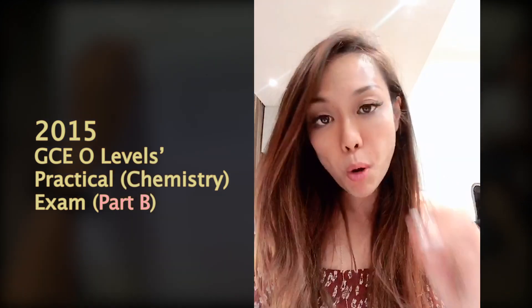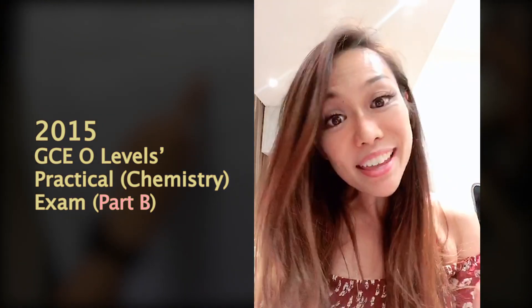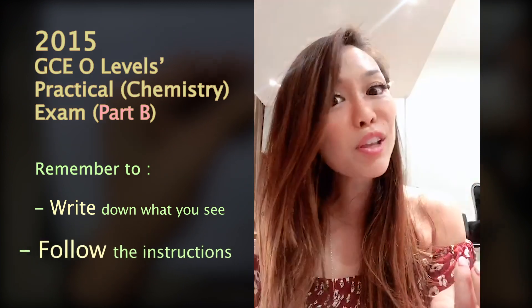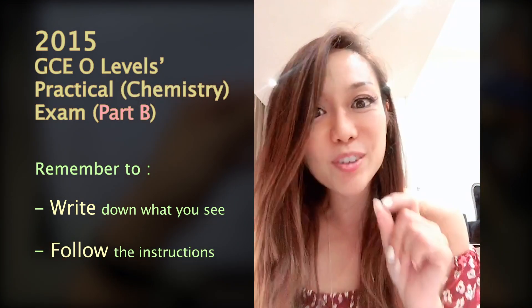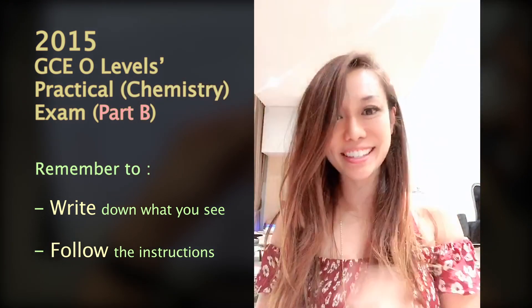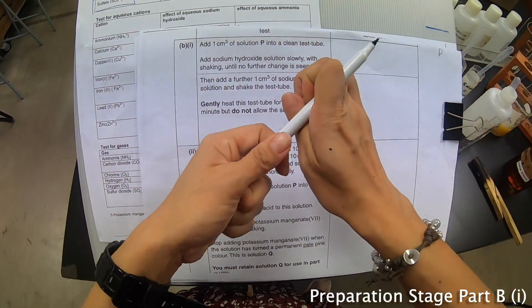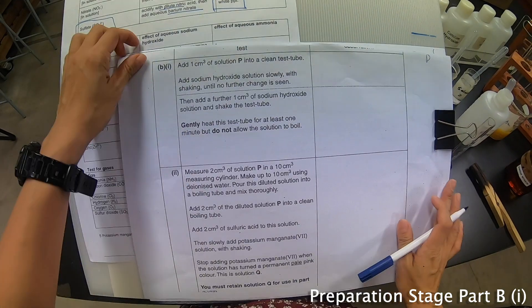We are now coming to the second part of 2015. This portion here is a fresh new sample. The same thing applies — if it's a fresh new sample, always remember to write down what you see and then follow the instructions. This time round you're going to see something interesting. Now the next part, which is the second part — we are coming to the second part already.